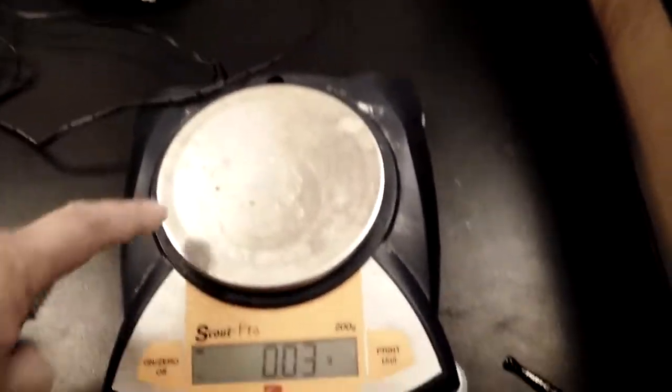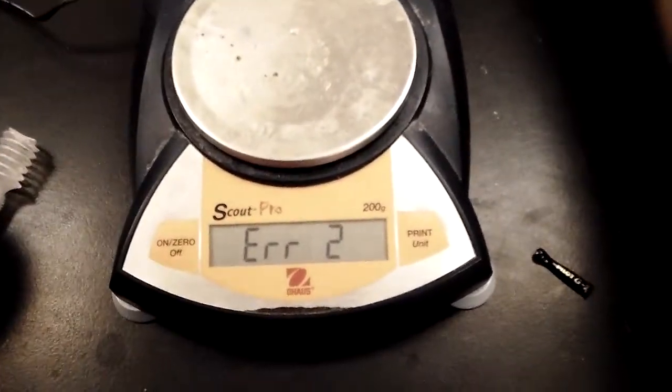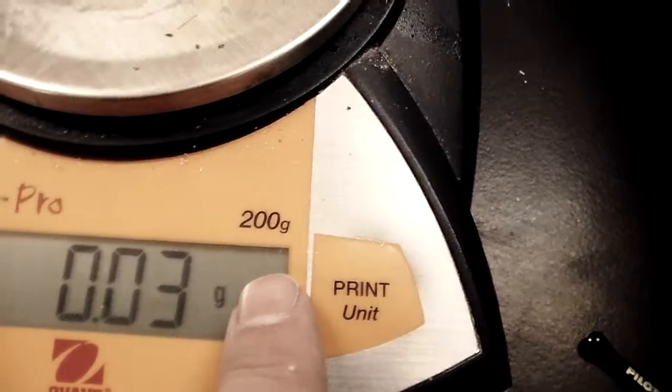Can you overload this thing? Yes. See — ERR2. That means get it off the balance. It's too heavy because there's a maximum capacity of 200 grams on there.